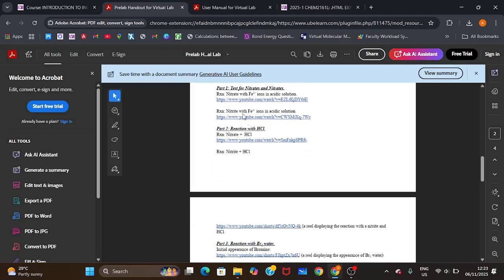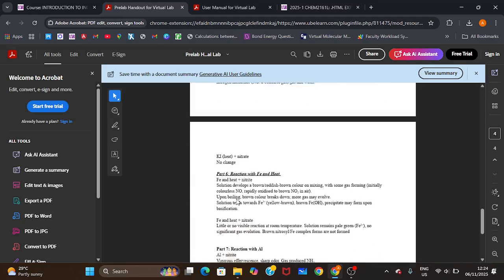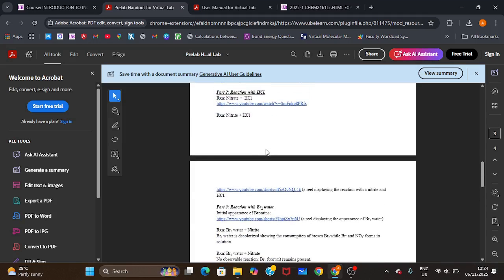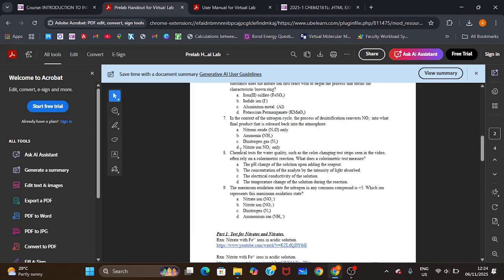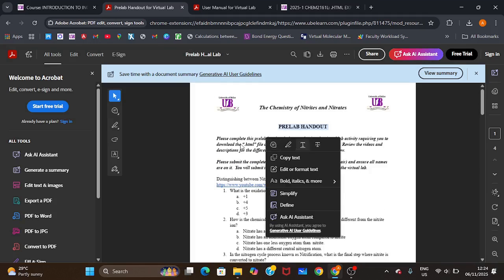So you'll have part one, part two, part three, all the way to part 8. For some of them, videos were not available to us, so we had to stick to basic descriptions of what you should expect. But again, this should only serve to be complementary to the actual simulation you will be doing. Keep in mind that questions 1 to 9 will serve as your pre-lab. So this is one of the files that you need.